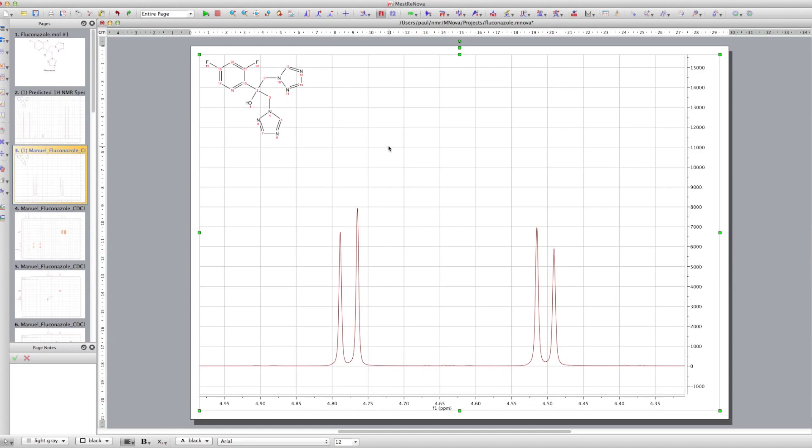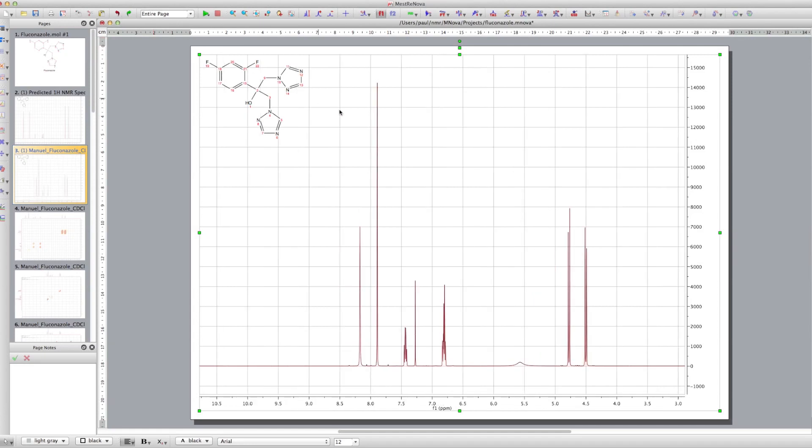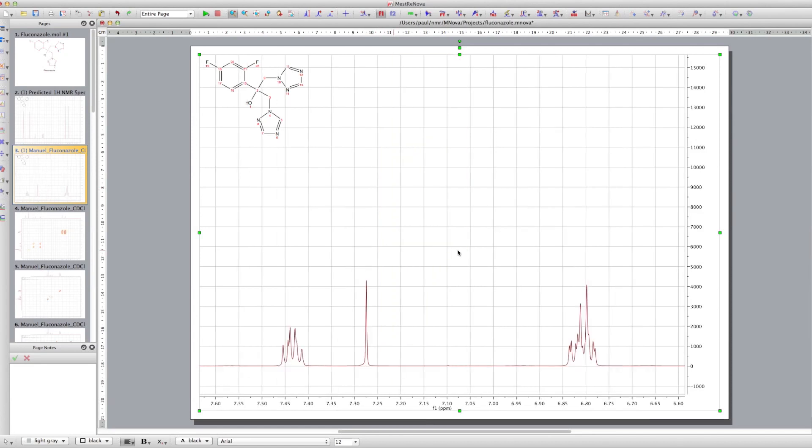Now, the reason you're getting doublets of peaks is because the molecule is actually, although it's achiral, if we change one of those protons, then we'll form diastereomers. We've almost got a chiral center there. So it becomes diastereotopic centers.